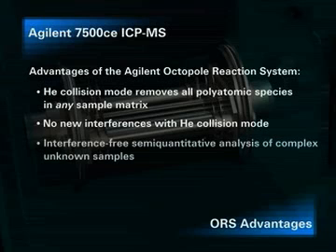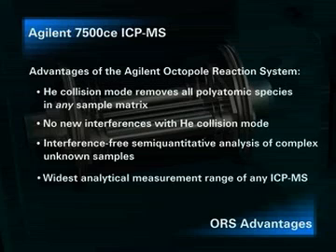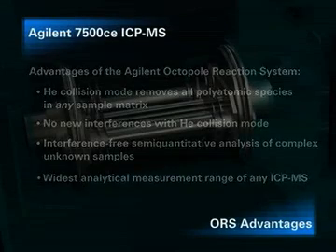Helium collision mode enables rapid and accurate semi-quantitative analysis. More than 60 elements can be measured in a completely unknown sample in approximately 1 minute without the need to run calibration standards. The 7500ce can measure mercury at single-figure parts per trillion, plus sodium at greater than 1,000 parts per million in the same analytical run.